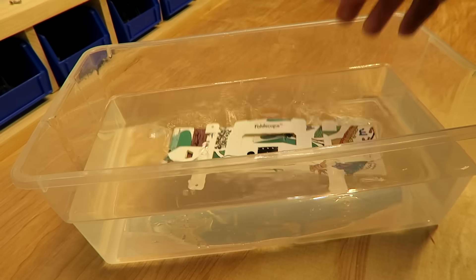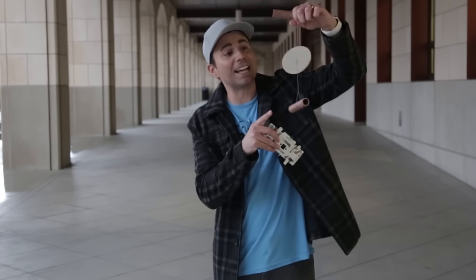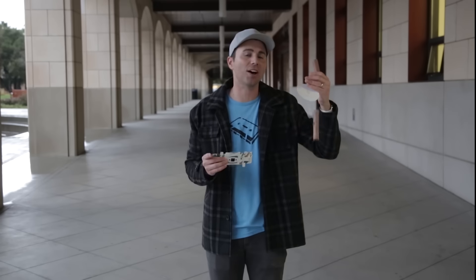So this might be... I'm holding in my hand a microscope that is waterproof, stomp-proof. I put it together in 2 minutes and it costs 50 cents to make. And in this hand, I have a blood centrifuge that spins 10 times faster than a $10,000 centrifuge, and it costs 18 cents.